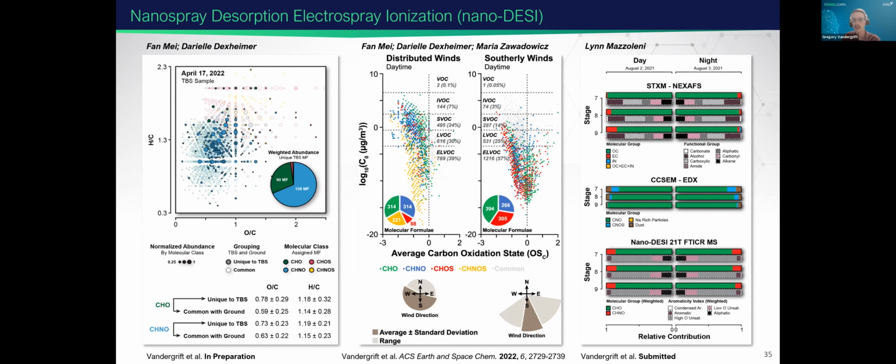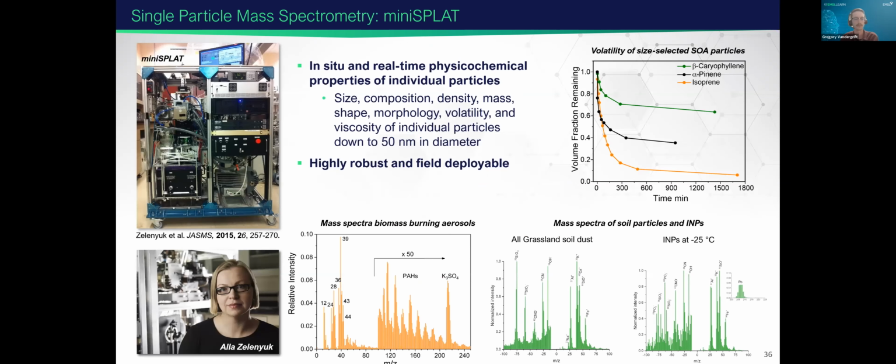So I won't get into the details specifically of this figure, but I wanted to present it to show that STXM/NEXAFS, something touched on by Narun Nahar, as well as computer-controlled scanning electron microscopy, all capabilities that we offer at EMSL, can be used in a complementary fashion to our other mass spec-based capabilities.